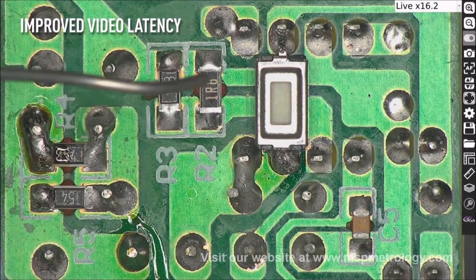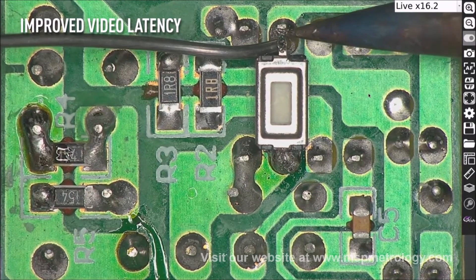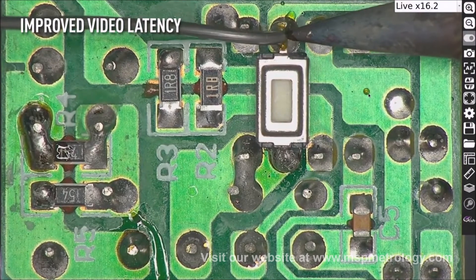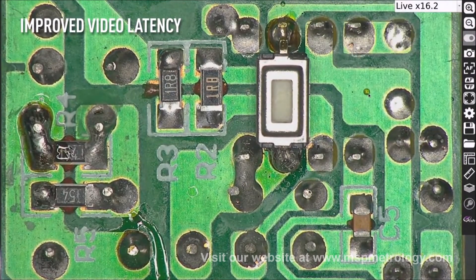The ASHCAM module has no video delay. View parts in real time with no video lag, allowing you to comfortably inspect, rework, modify and assemble any part.